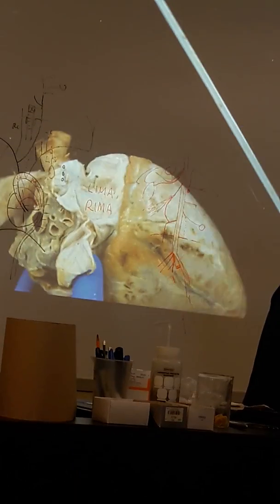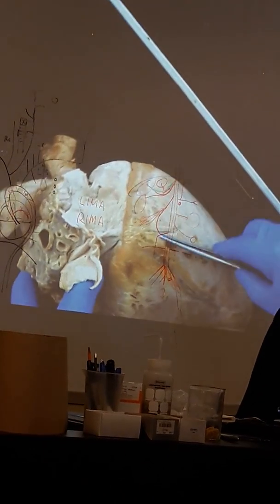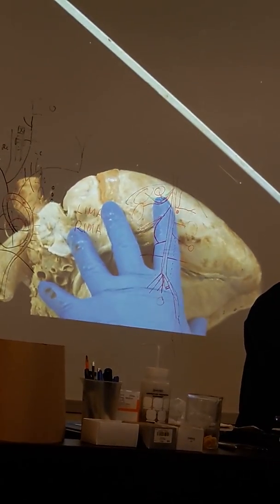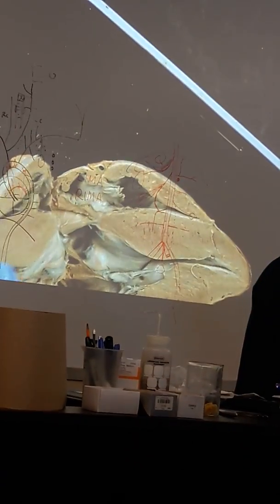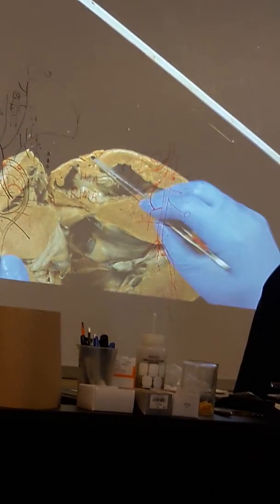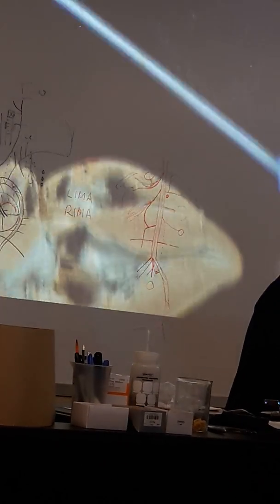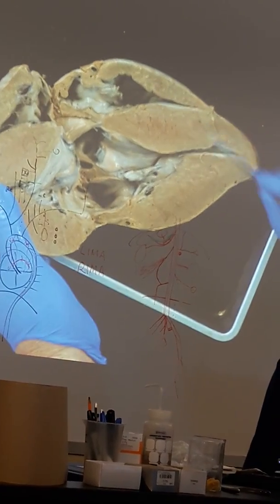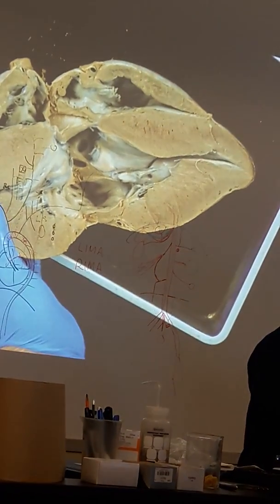Coronary vessels. Coronary vessels, you can see some superficially. Okay, those mostly are the veins. Okay, coronary vessels. Coronary vessels including both coronary artery and the vein. But if you open that, okay, you can see this and this. Oh, you see the holes over here, over here, over here. Those are coronary vessels.